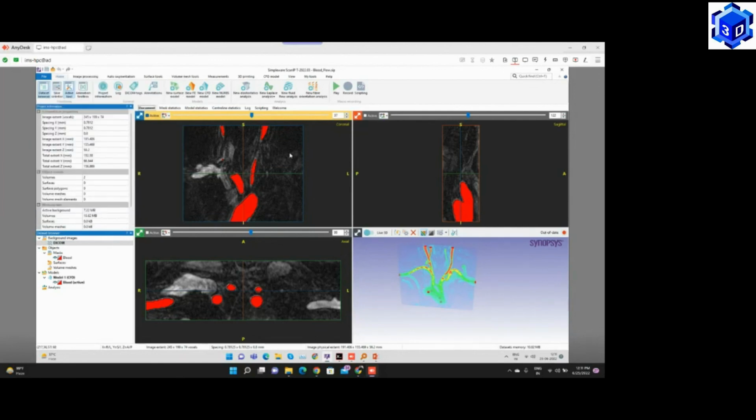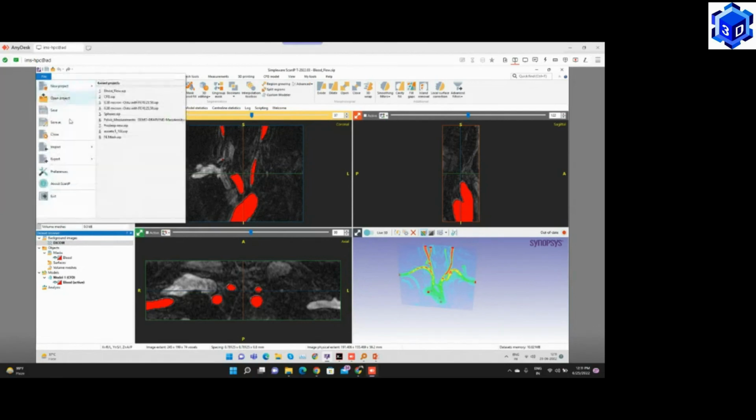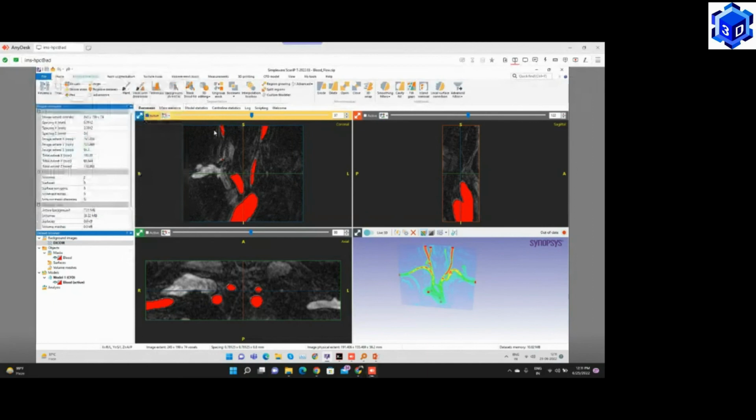Right now we have very little time, so I'll just give you a basic overview. These are the different sections, and these are the tools which allow you to perform the different processes during image processing or 3D printing. When you import the image from here, you can see all these tools are arranged in chronological order, because you are always going to process the image before segmentation.